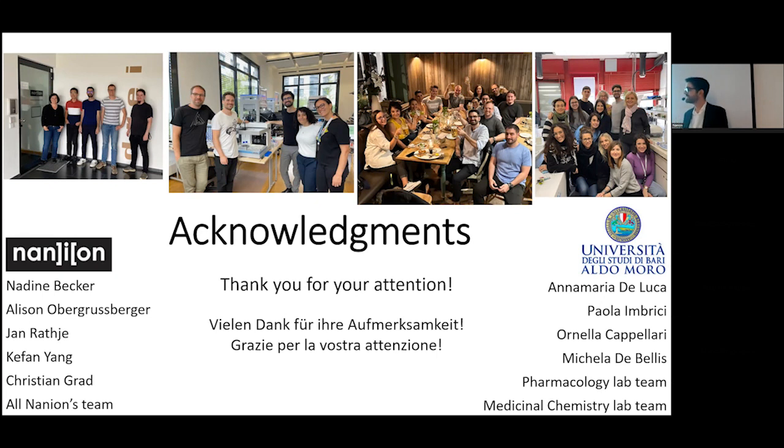I have a quick question for you about your future work using the enzyme detachment process. What choices will you use? In my experience, Accutase can be quite soft, and it's maybe not the strongest thing to use. Would you go in a stronger direction?